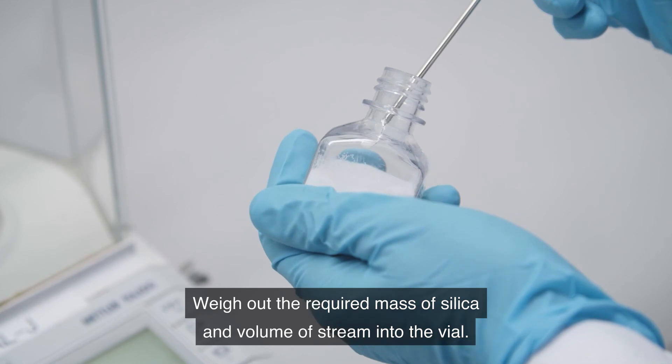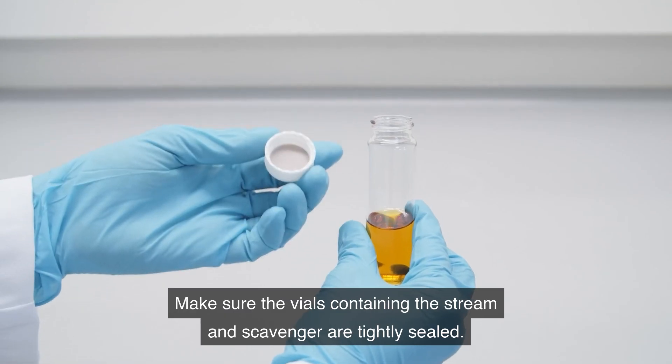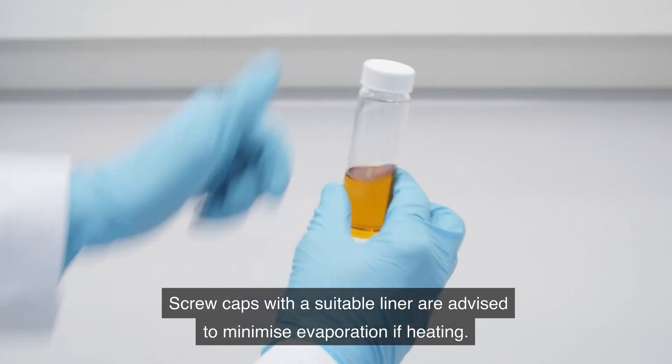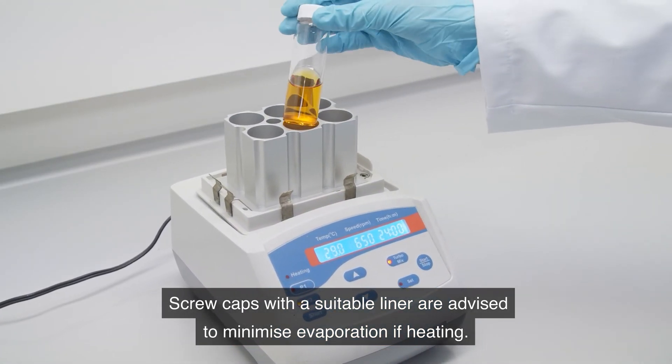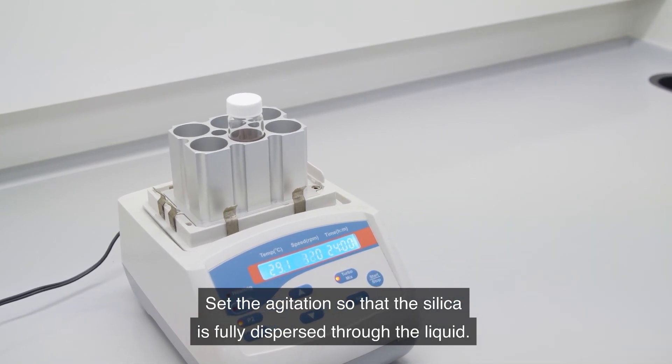Weigh out the required mass of silica and volume of stream into the vial. Make sure the vials containing the stream and scavenger are tightly sealed. Screw caps with a suitable liner are advised to minimise evaporation if heating. Set the agitation so that the silica is fully dispersed through the liquid.